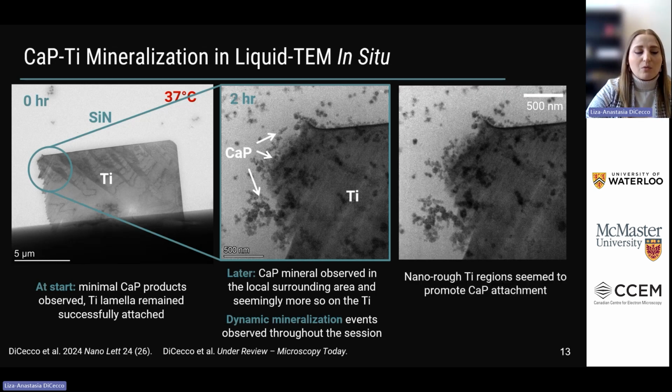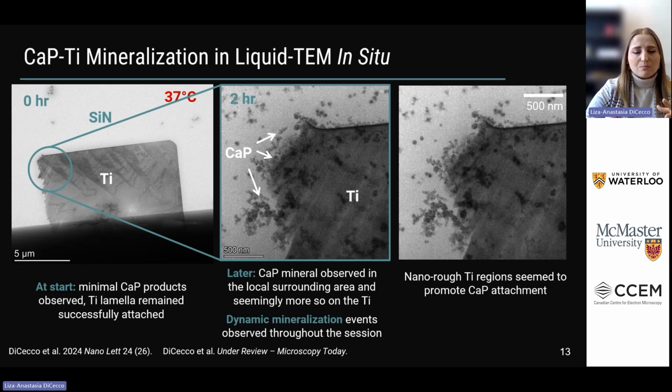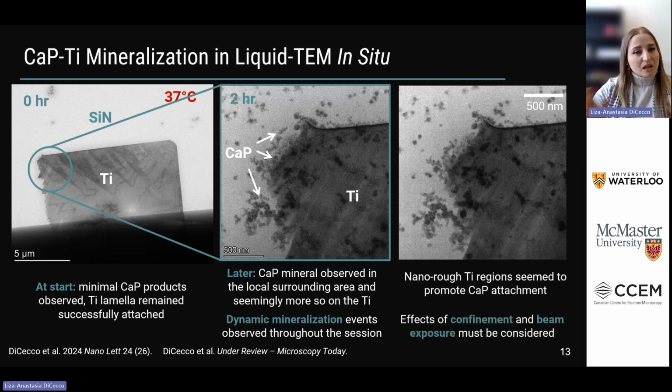We did also note, I mean, we couldn't create a perfectly smooth lift out, but we saw that nano rough areas seem to promote the adhesion of these nanoparticles more, which is really exciting, still in exploratory phases, but has some relevance to implant research where people are exploring nanotexture for implant and biomaterial development. Key thing to note, and this is described more in the paper in detail, but confinement and beam exposure still must be considered when we're considering this kind of system as a whole.